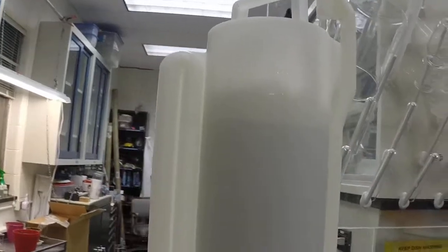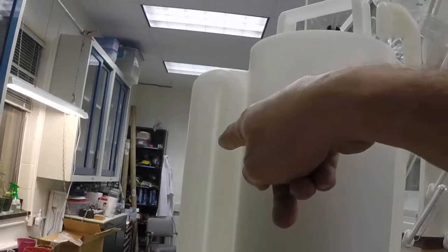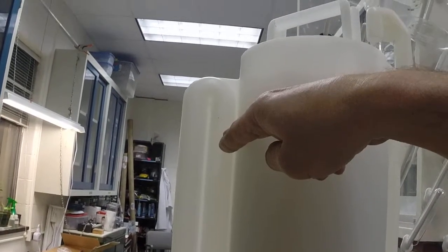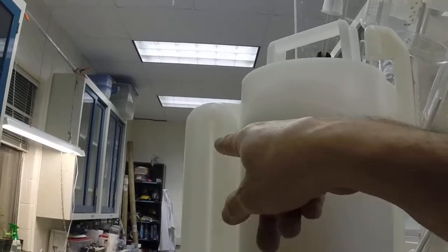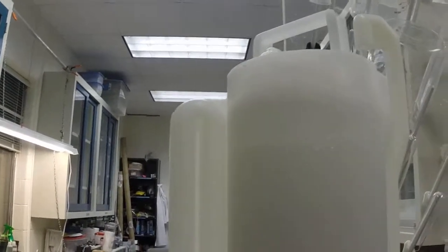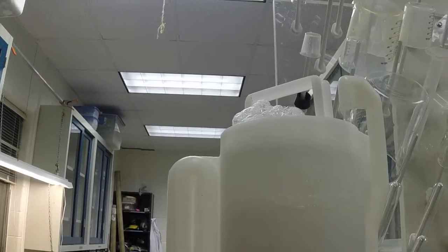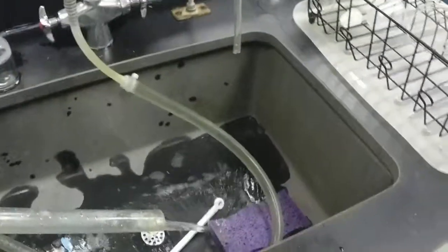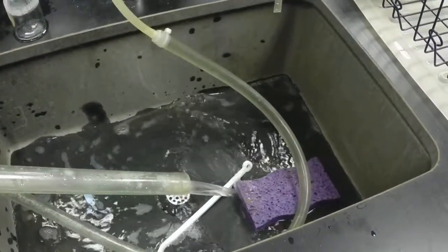You can see now the water level's gotten up to here and it's coming up this side tube. Once it gets up to here it looks like it's going to come out the top but instead it actually creates the siphon. Once that siphon is created you'll see that it'll start to come out down here and it'll come out pretty readily as you'll see in a minute.